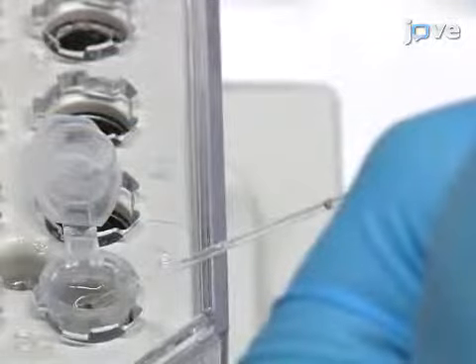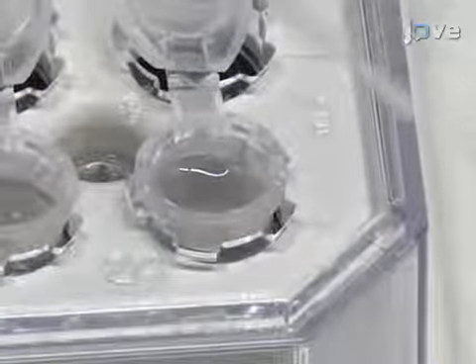and stick the capillary into the liquid agarose, slowly drawing a few microliters of the agarose along with the embryo into the capillary. When the embryo is in place, there should be a few microliters of agarose both above and below the embryo.